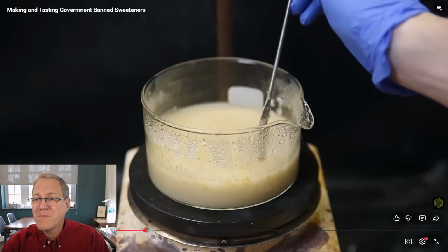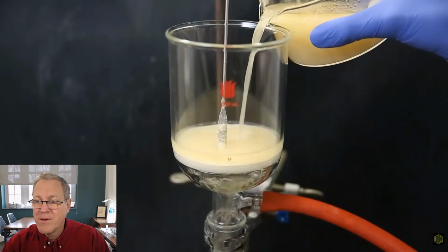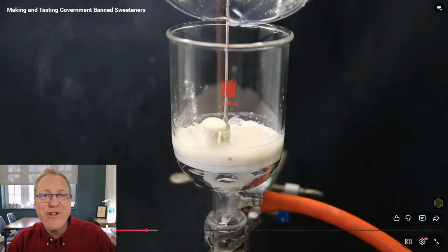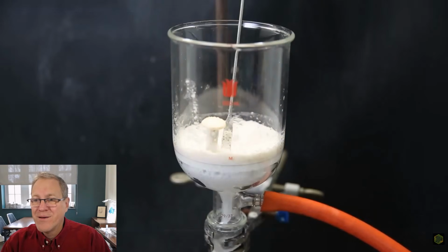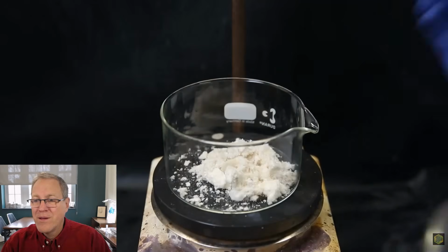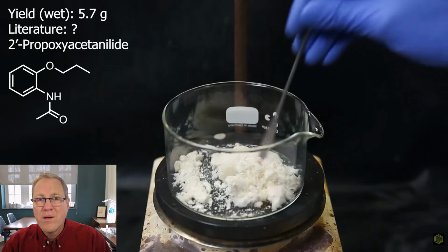I also added some more water to make sure all of my product precipitated. And I then set it up for vacuum filtration again. I wash it with some more water. Okay, it's that fritted funnel again now. Where's your Buchner funnel? But he's going to work in the fritted funnel. And then dry it on the filter for a second. I move it to a dish, and I am left with a slightly off-white solid. That should be mostly 2-propoxy acetanilide.